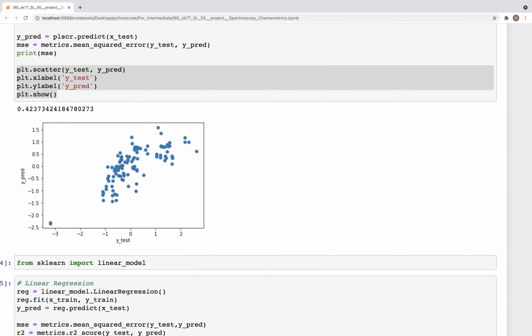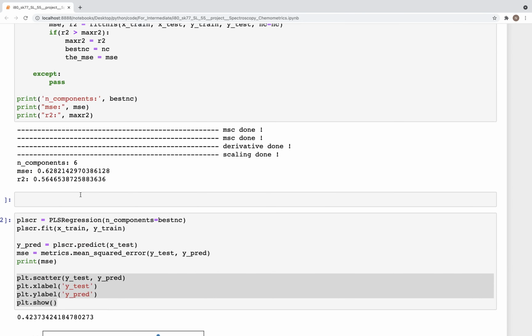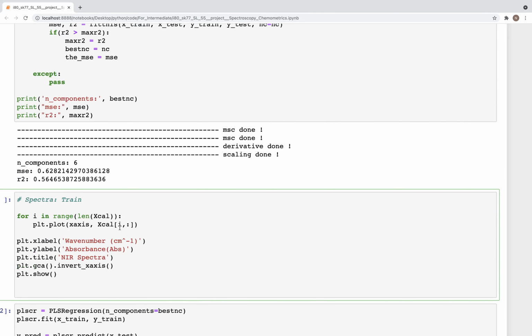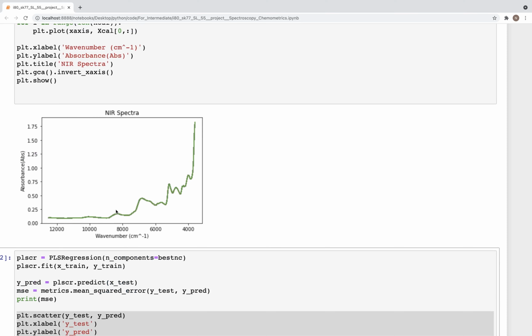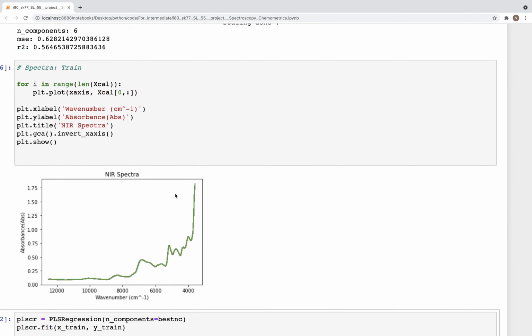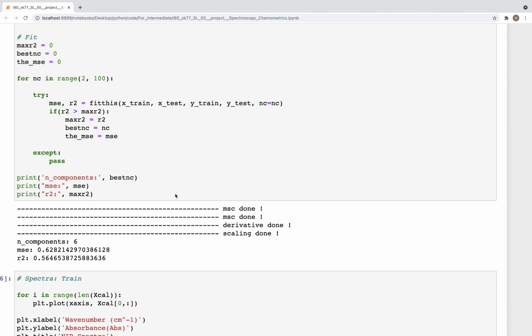I'm going to put that one right here, and let's look at just one plot. So as you can see, this particular part all the way up to maybe 9,000 is straight and constant. So what I'm thinking is, if we remove that part, that might help us lower our MSE further.